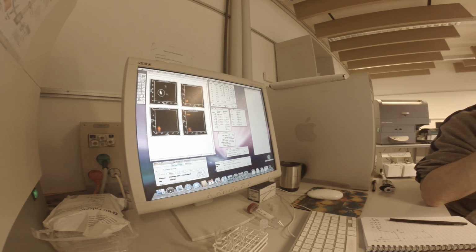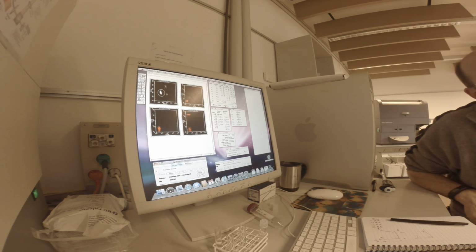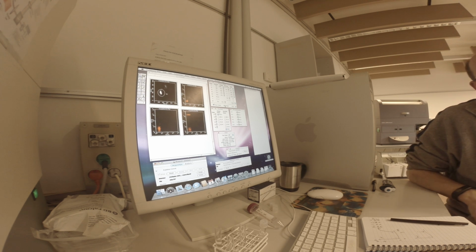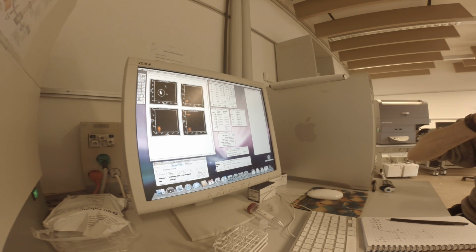I think it is. I have to develop a feeling. I don't have a number that I take from my pocket. There's not a solution where all the numbers are just sitting in your protocol. You've got to know what you're doing. Because otherwise it's the black box that's controlling you. Then you wouldn't have the need for detection and calibration. The machine could just punch in the numbers and carry on. That's right.